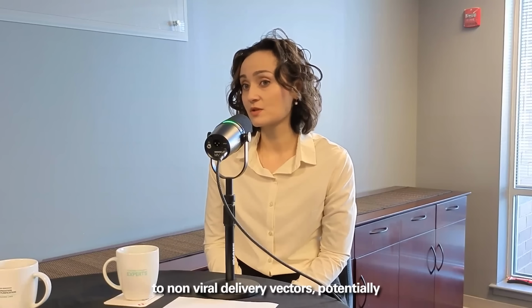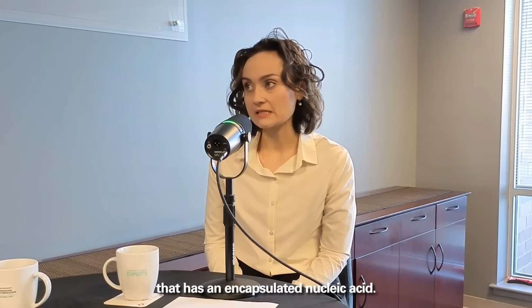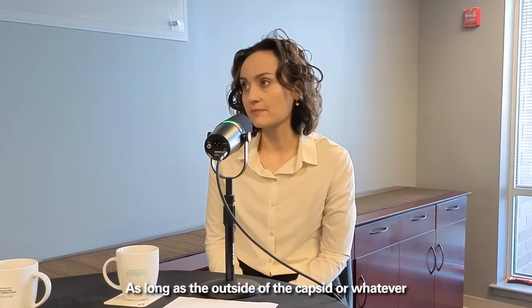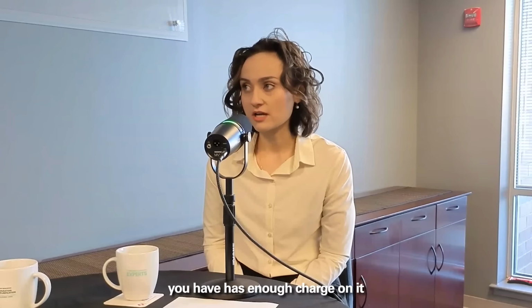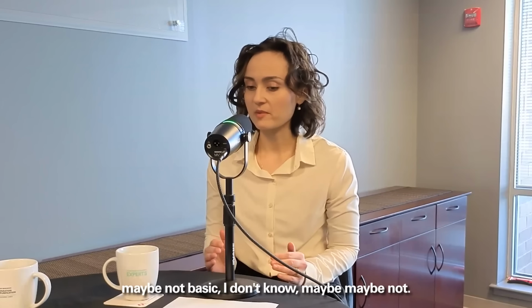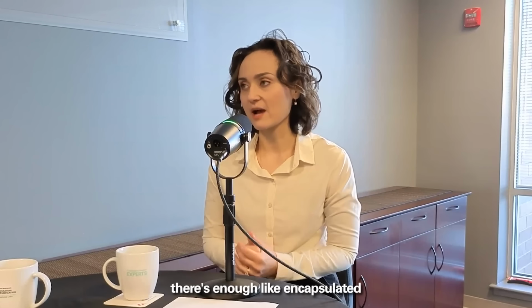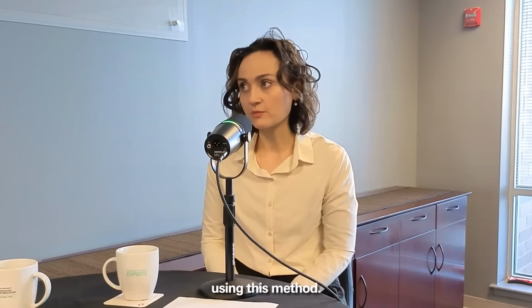also broaden this to non-viral delivery vectors, potentially, with anything that has an encapsulated nucleic acid, as long as the outside of the capsid or whatever delivery vehicle you have has enough charge on it. It is pretty basic. Maybe not basic, I don't know. As long as there's enough encapsulated DNA within, it's very possible that you could separate that using this method.